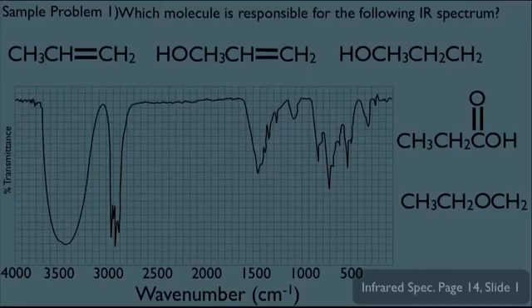So here's the correct direction. Don't start with the IR spectrum, meaning don't run to the IR and start looking at peaks and trying to see what those peaks mean. The correct place to start to make this easier is simply to start with the molecule. Here's what I mean by that. Let's start with this first molecule right here. What you do is pick out something in this molecule that is unique. And what's unique to him, of course, is his double bond. He's an alkene. Then you ask yourself, where would a double bond peak in the IR?